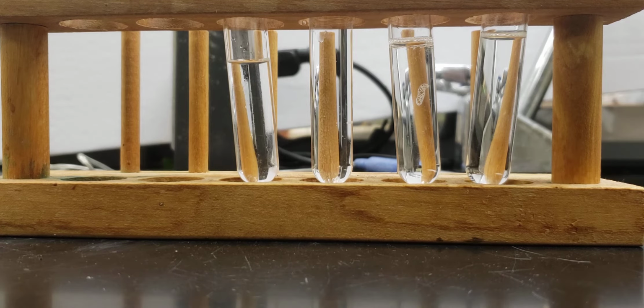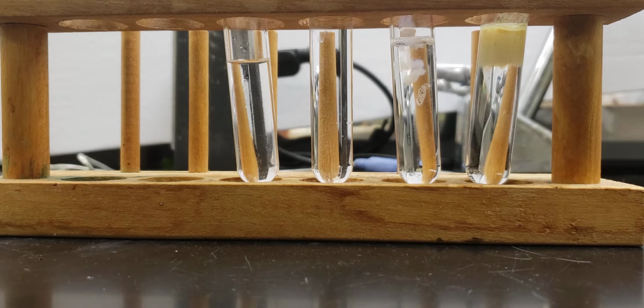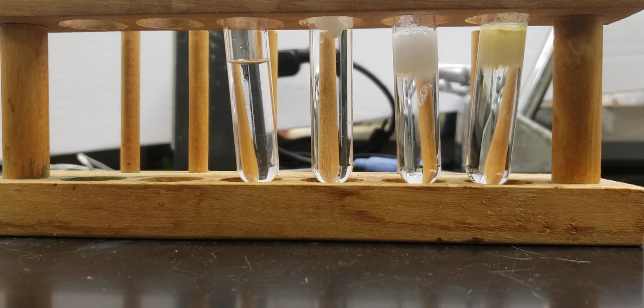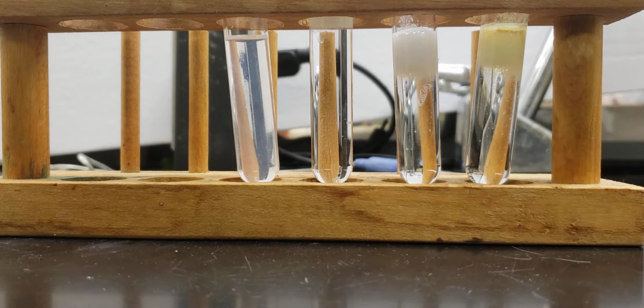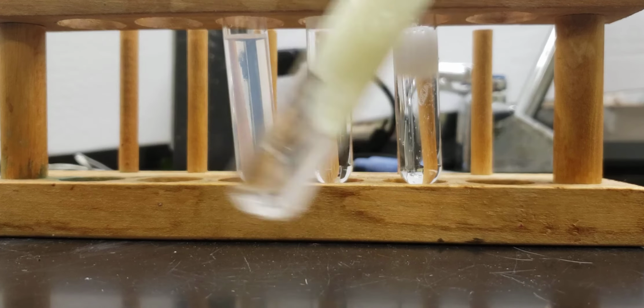So we're going to do this experiment now, and put just a couple of drops in here. As we can see, we have our first precipitate. We'll put the same thing in our second test tube, a couple of drops in our third test tube, and finally our last one with the water. Our goal is to evaluate what each one may have in it.